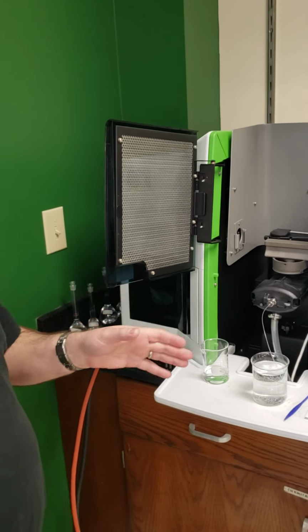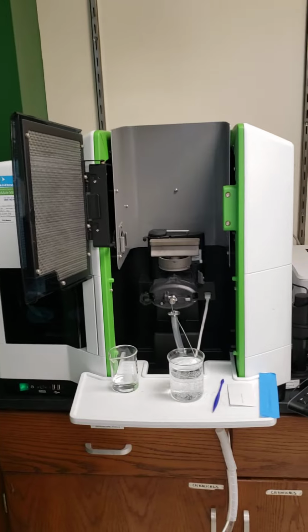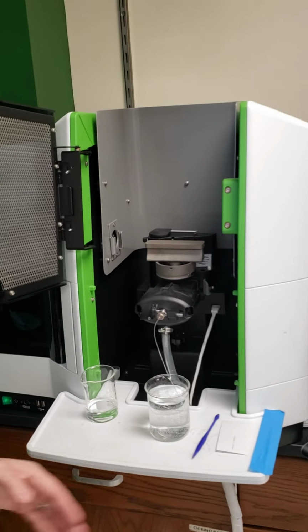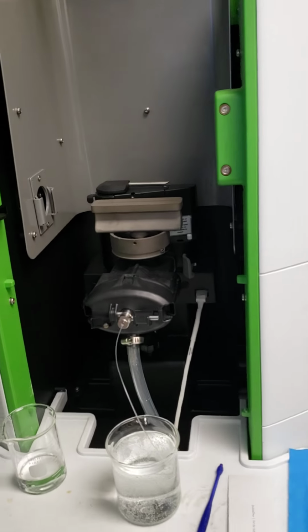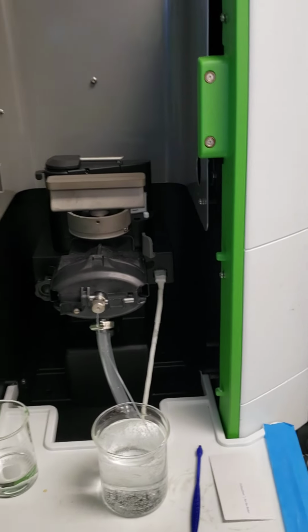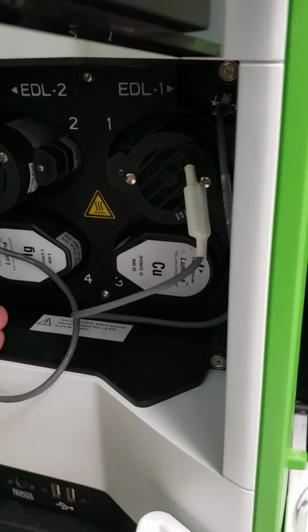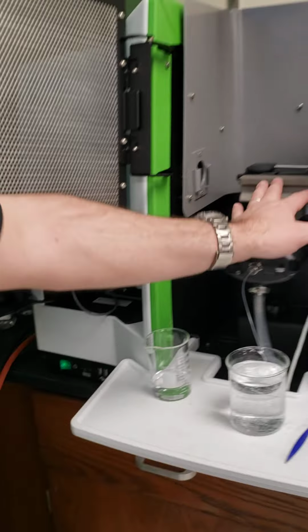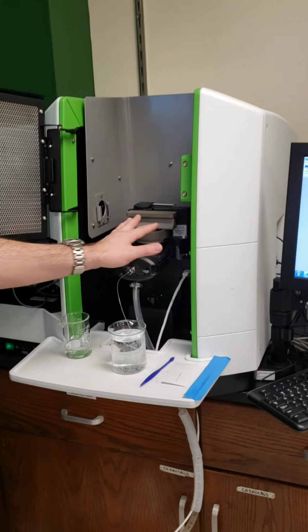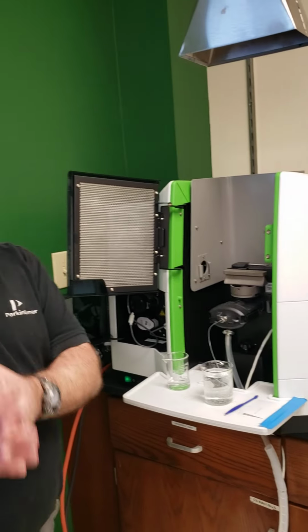And we have a prism and a grating that both move in conjunction to let just that wavelength of light out and go through the flame. So you have atomic copper here emitting copper wavelengths, or lead, or whatever element you're using, so that if you're using a copper lamp, any copper in the flame will absorb those specific photons at those specific energies.